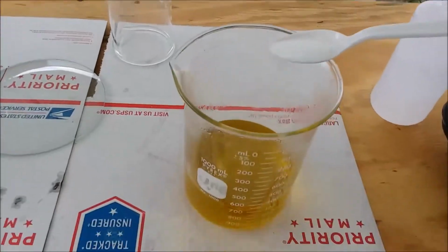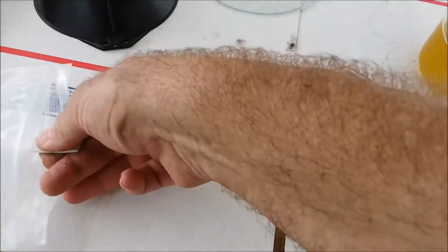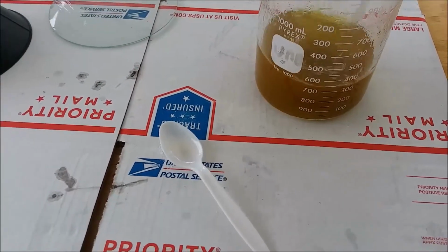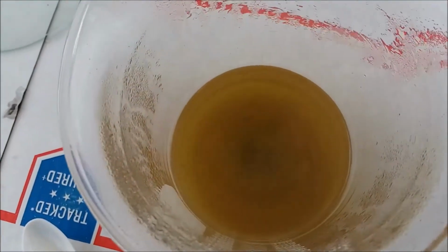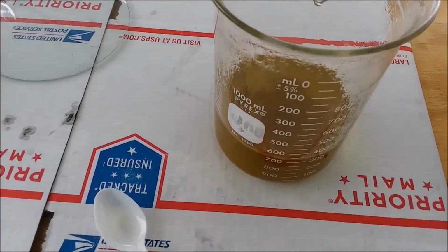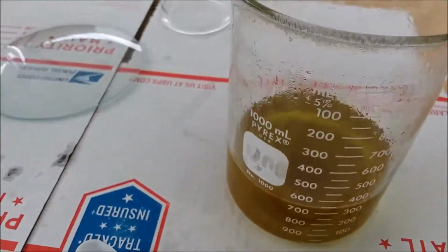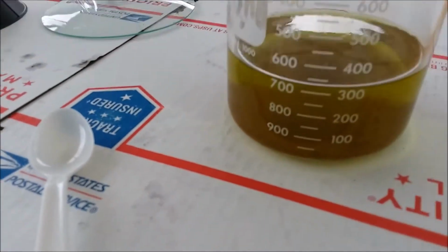Here goes some sodium metabisulfite. Whoa, okay, that's a pretty vigorous reaction. You know what? I'm thinking there's still some chlorine in there. I did get a color change. Oh, okay. Look at that. Yeah, okay, it's starting to precipitate. Yeah, it's precipitating quick. Okay, and it's pretty big gold. It's dropping out fast. Maybe doing it hot's better. Look how fast that's clearing up.